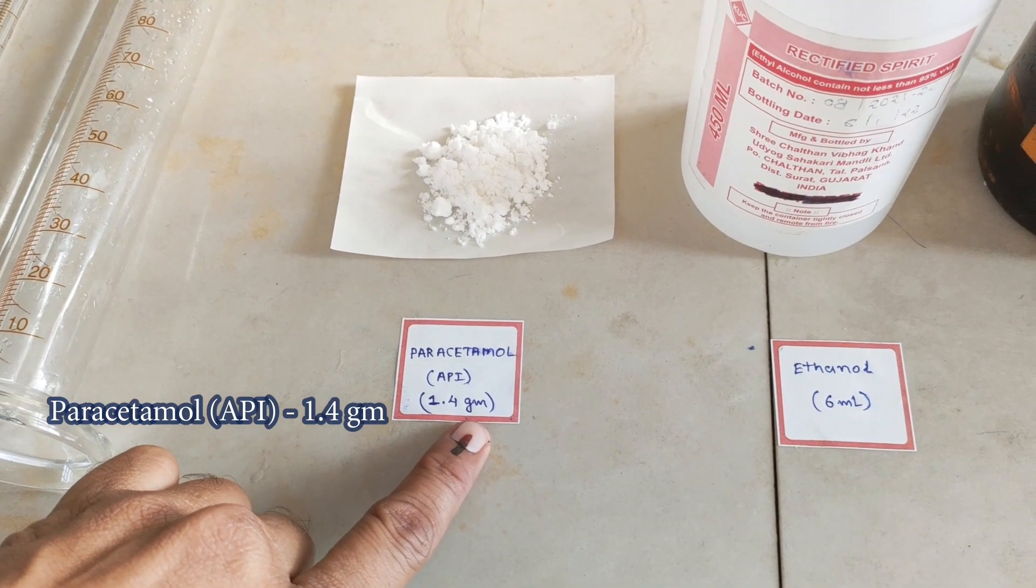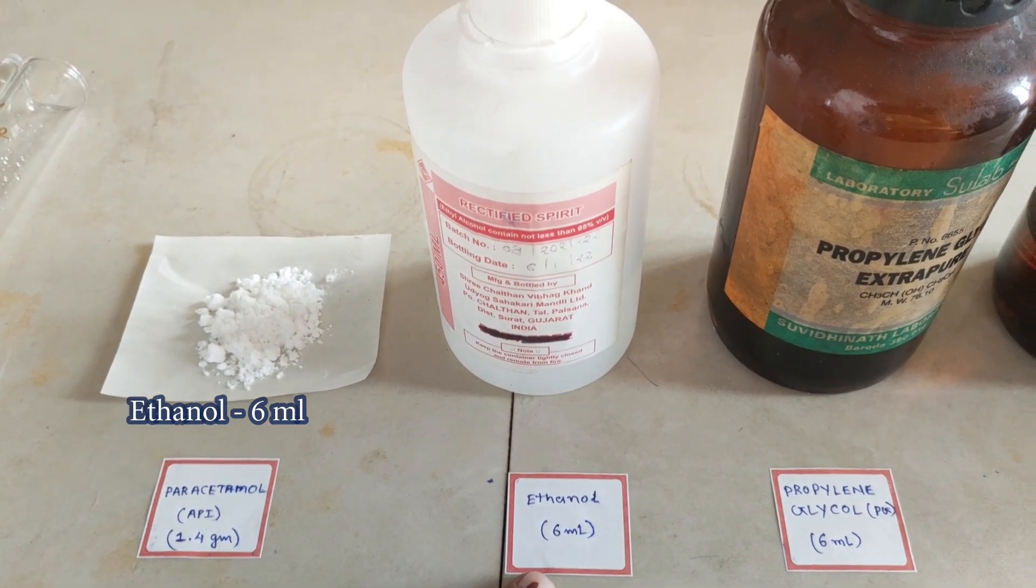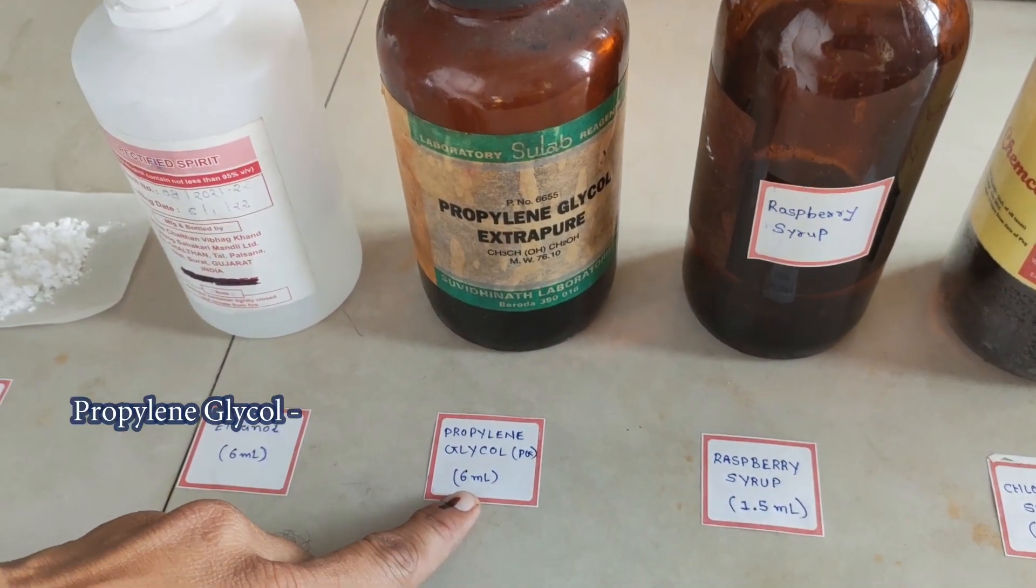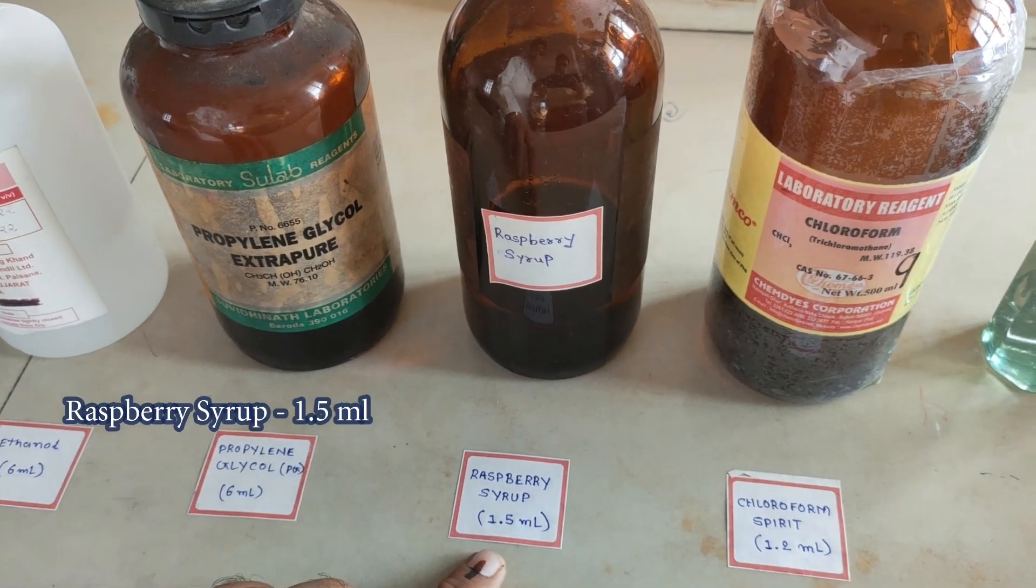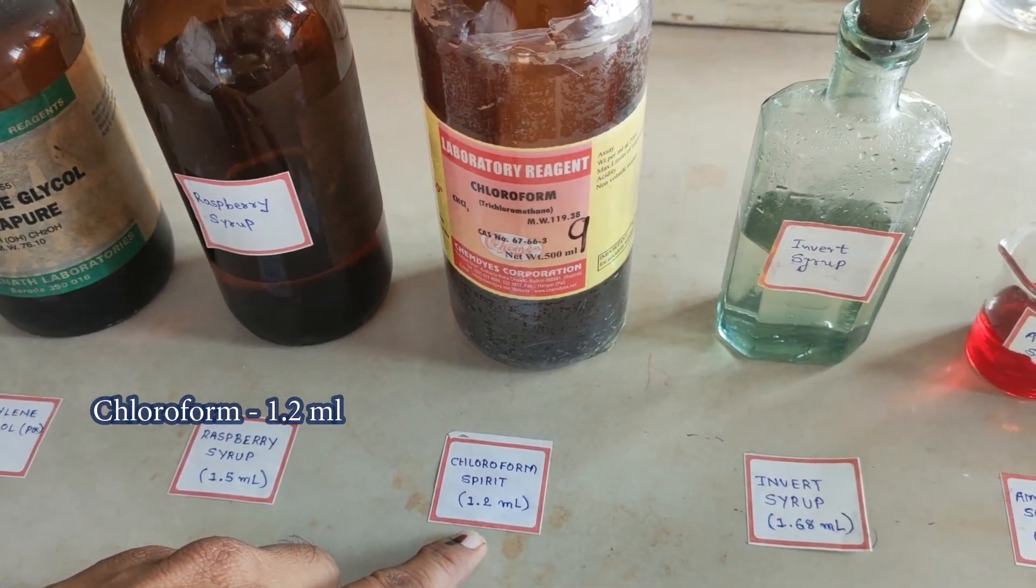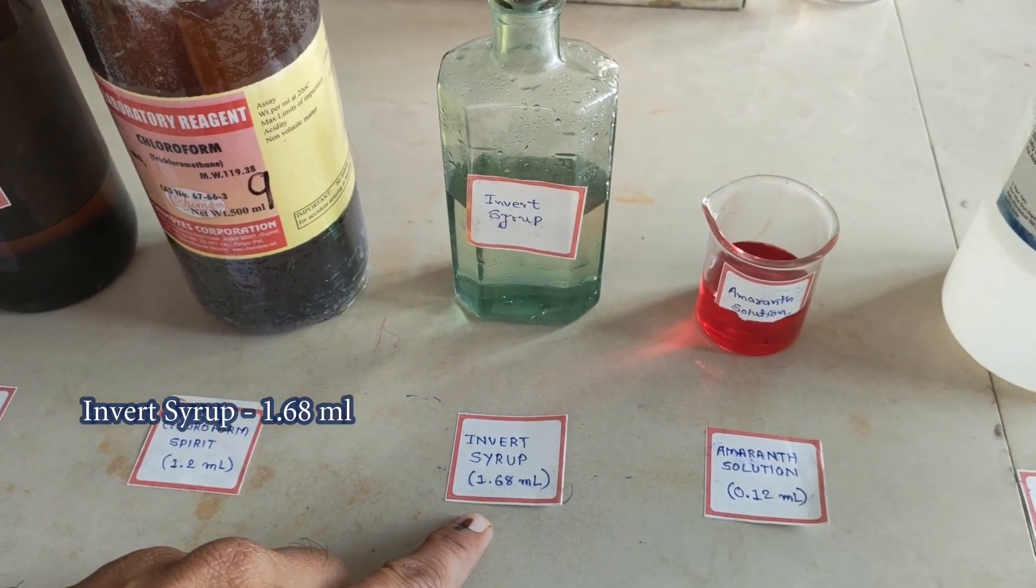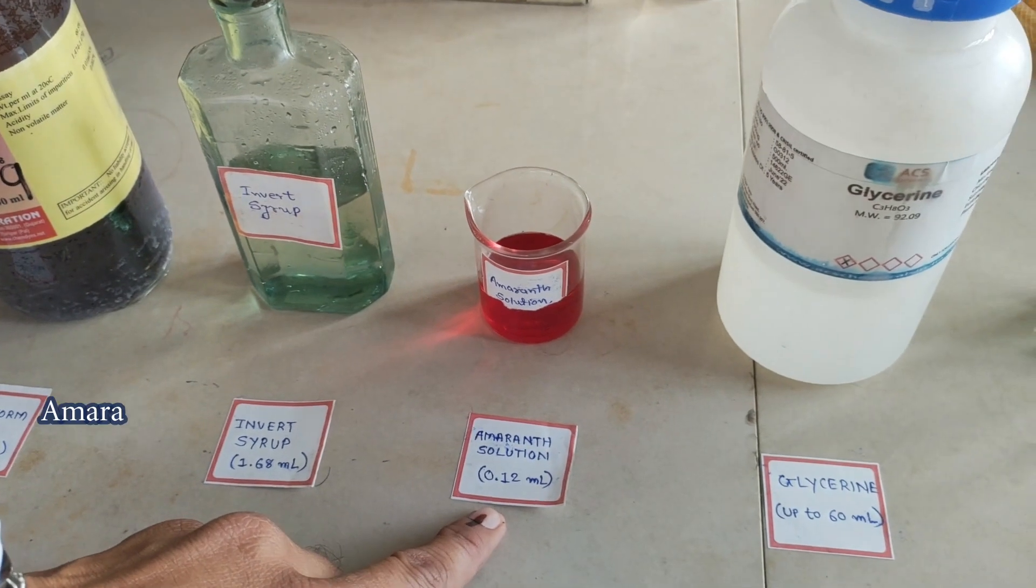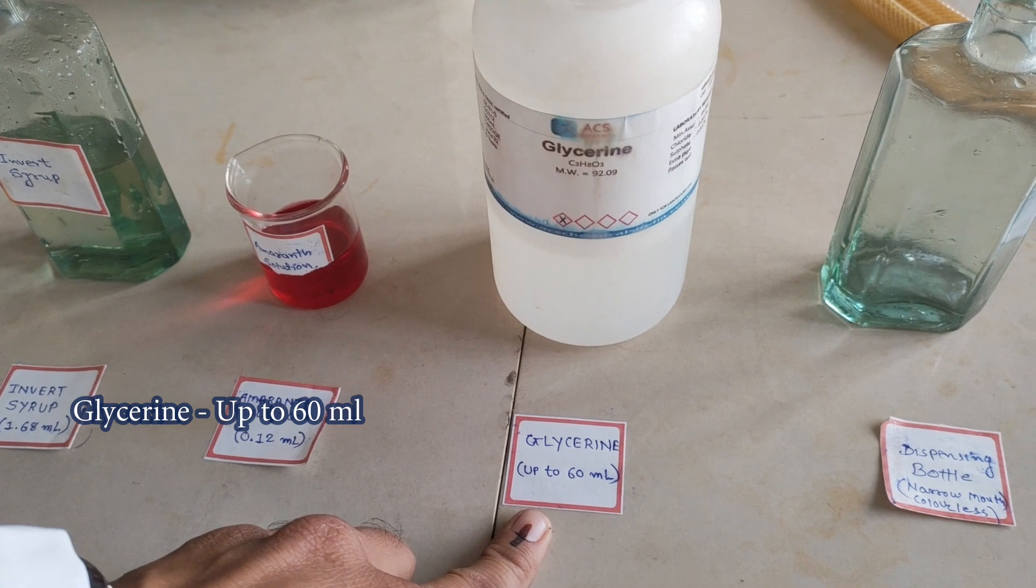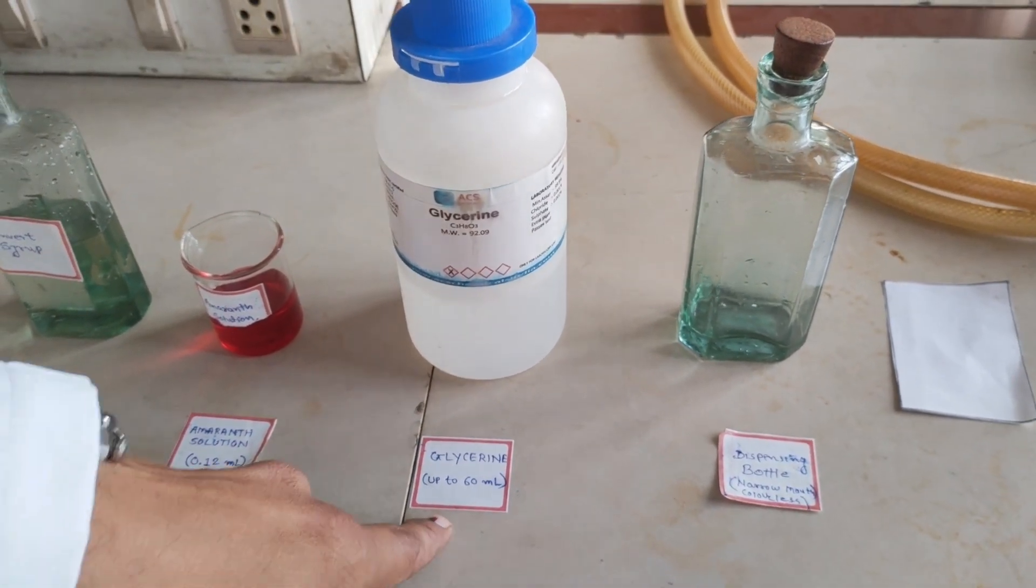We are going to use 1.4 grams paracetamol, 6ml ethanol, 6ml propylene glycol, 1.5ml raspberry syrup, 1.2ml chloroform spirit, 1.68ml invert syrup, 0.12ml amaran solution, and glycerin as vehicle up to 60ml.